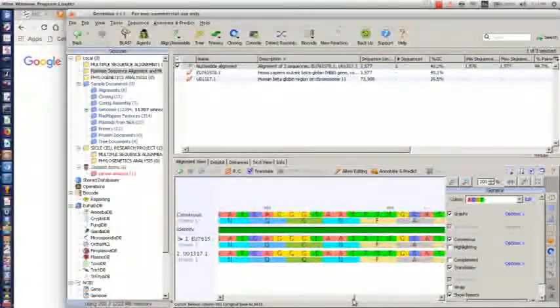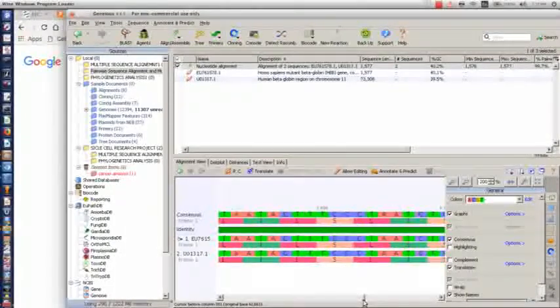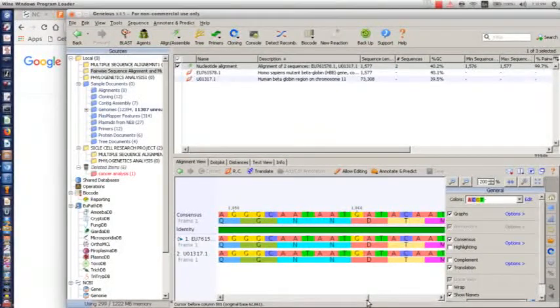So let's keep going. But there are times that we have a change in codons, in the nucleotide base, that yields a particular codon. Are you getting that? It yields a particular codon, and then the codon codes for an amino acid, but the alteration or the mutation that took place did not actually change the effects of the protein or the protein product.